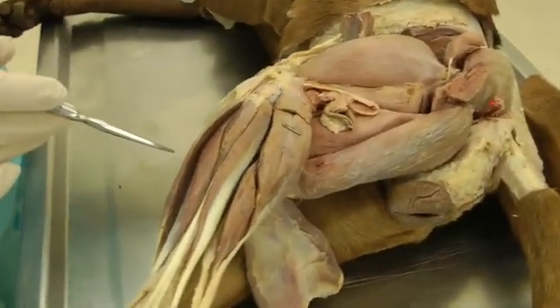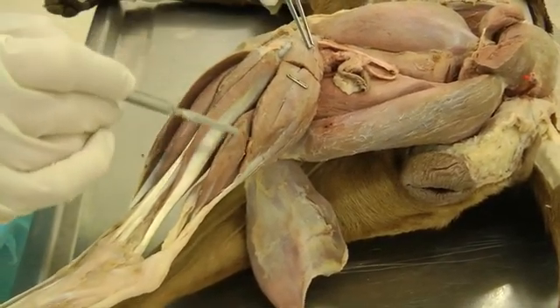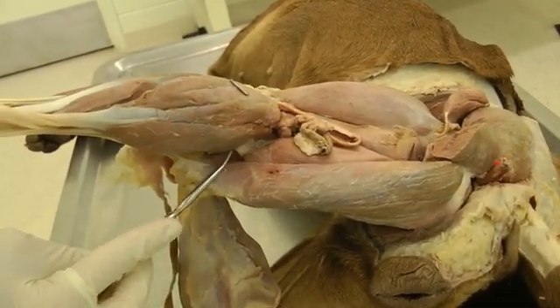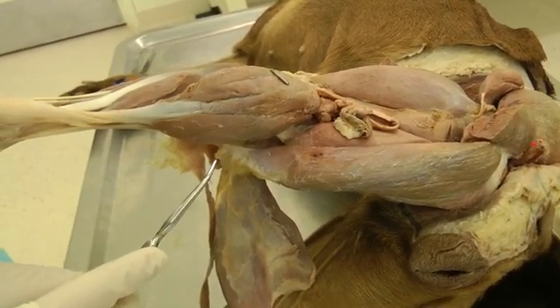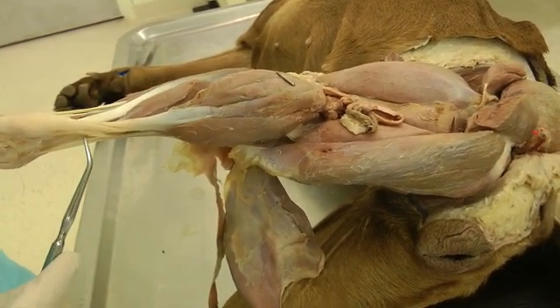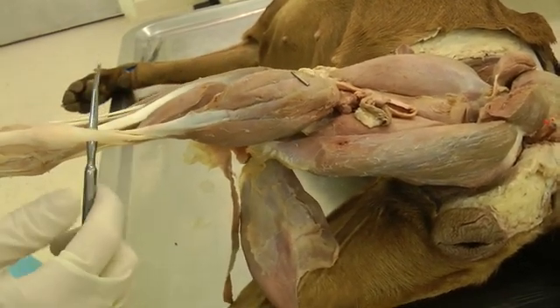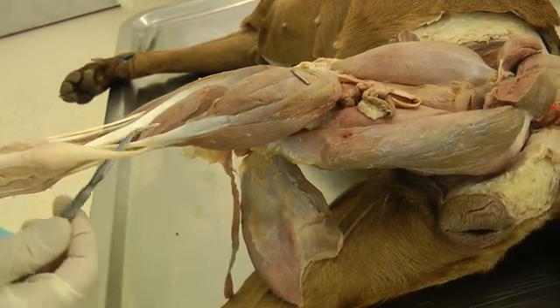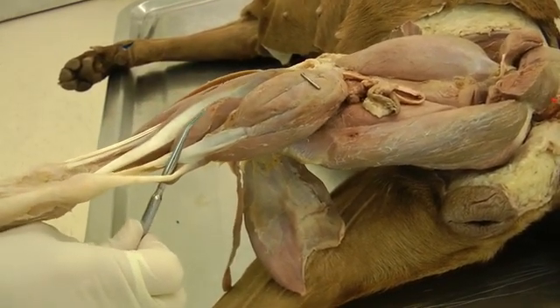We're going to start with gastrocnemius. There are two heads: here is the lateral head, and if I lift up the limb a little bit, we can see the medial head. Also in between those two heads is the superficial digital flexor, so we're going to have to be careful when dissecting the gastrocnemius. I usually come down to the tendons — this tendon coming out between the two heads is the superficial digital flexor. I start there and work my way up, separating it out so I don't accidentally cut the superficial digital flexor.